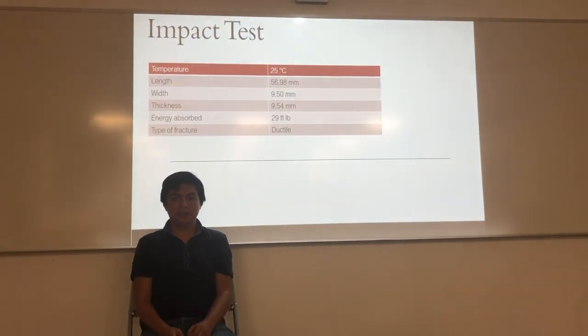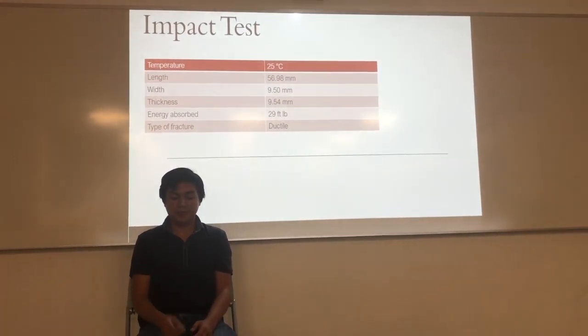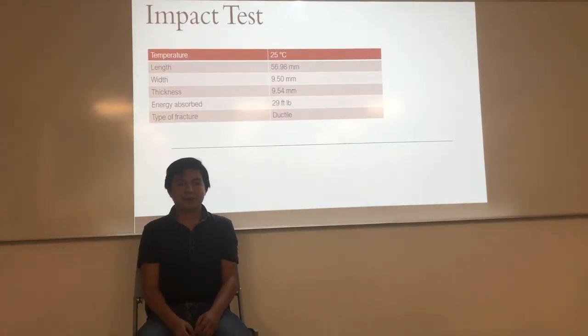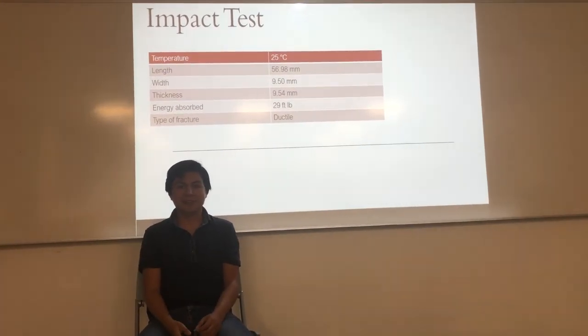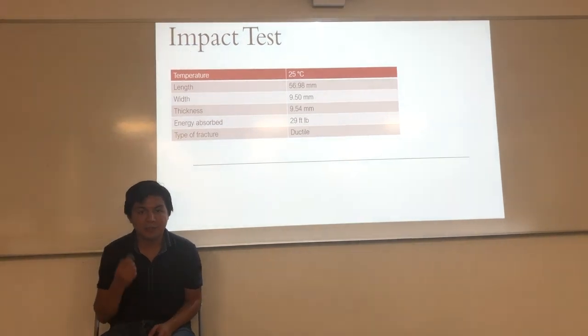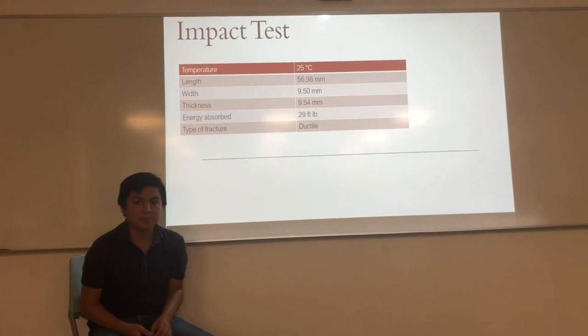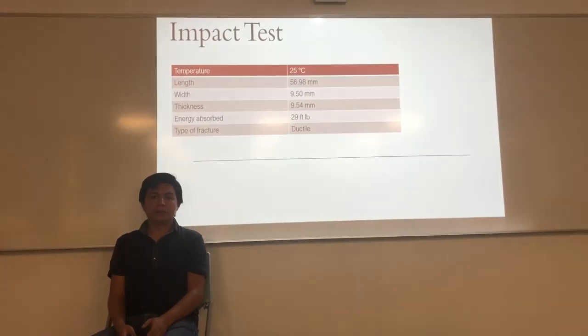The last test was the impact test, which was pretty fun because I had to smash this thing with a big hammer. Well, pendulum, but it seems like a hammer. Well, for the measurements of my piece that are shown in the table, I got an energy absorbed of 29 foot-pounds.